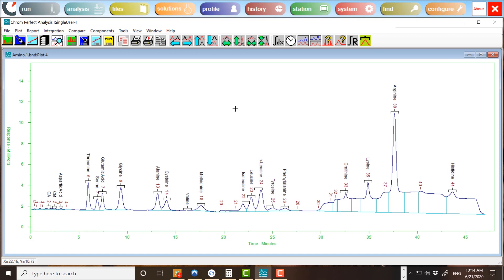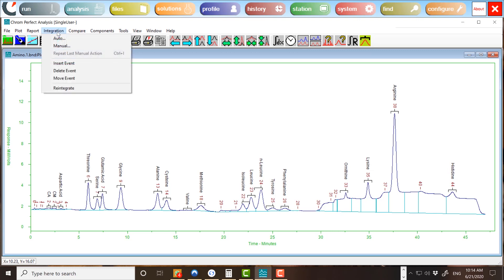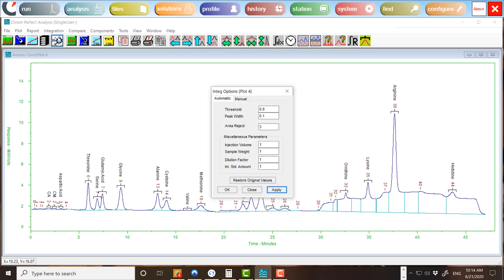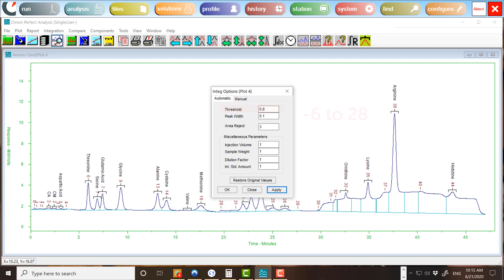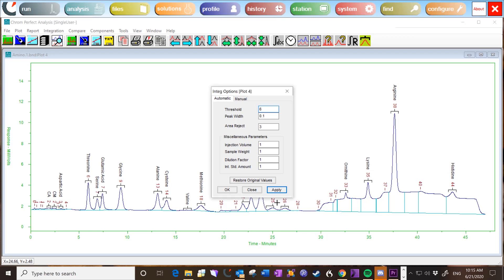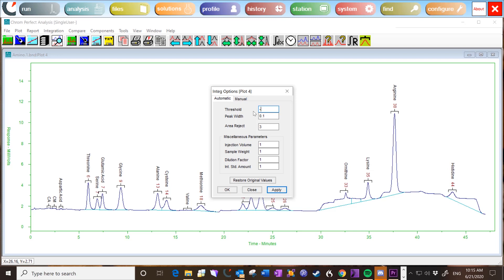To adjust the threshold and peak width settings, choose Integration and Auto. The following form will appear. The peak detection threshold tells the algorithm how much noise may be expected in the chromatogram. This number is dimensionless. Appropriate values range from negative 6 to positive 28. If the value is too large, then peaks will be treated as noise and missed. If the value is too small, then noise will be treated as peaks and the chromatogram will be littered with false peaks.